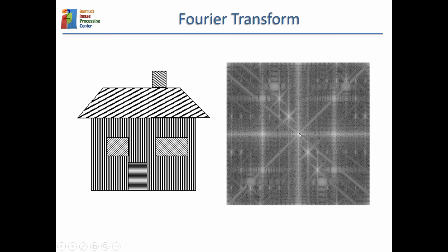The 0 frequency is just a constant that allows us to plot this image. And then we have other waves here, like for instance the door. The door is the highest frequency that we can have in this figure. It is 1 pixel white, 1 pixel black, 1 pixel white. That is the fastest you can go in a digital image. And we need some energy from that wave. So we annotate that we need energy here and there. And then we have other interesting waves like this one.